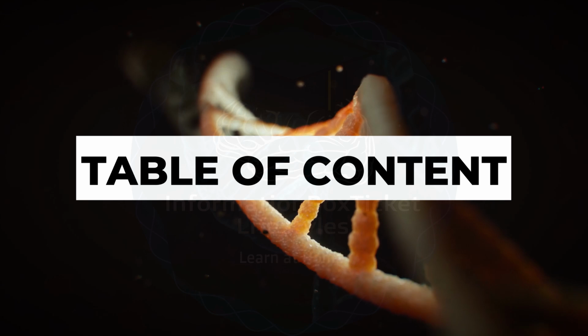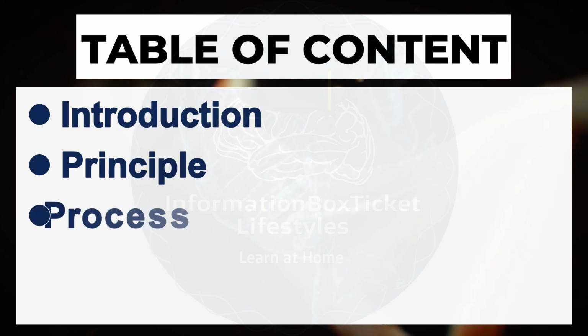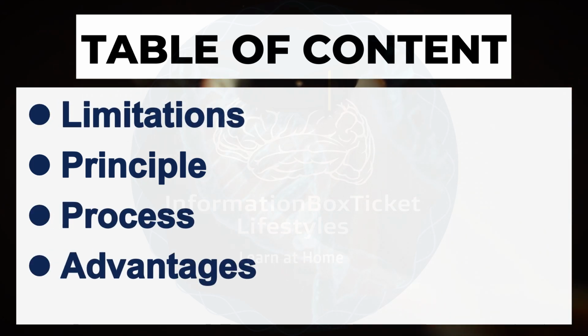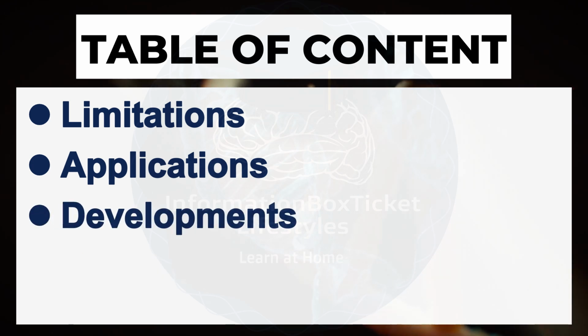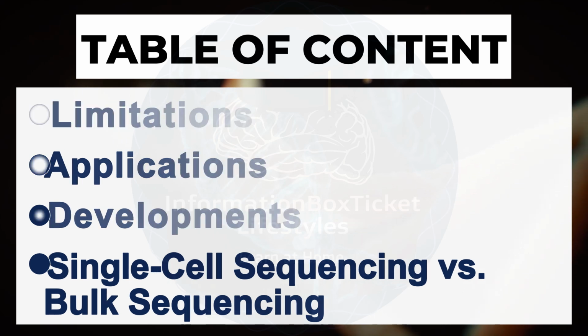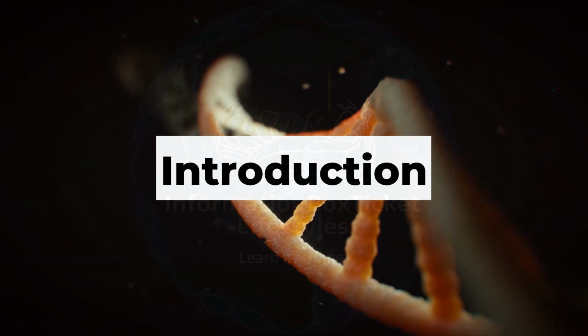Table of contents. Introduction to single-cell sequencing. Principle. Process. Advantages. Limitations. Applications. Developments. Single-cell sequencing versus bulk sequencing. Introduction to single-cell sequencing.